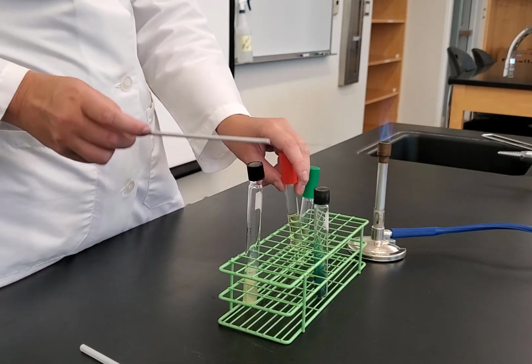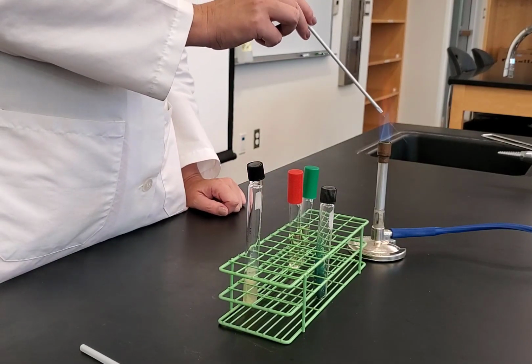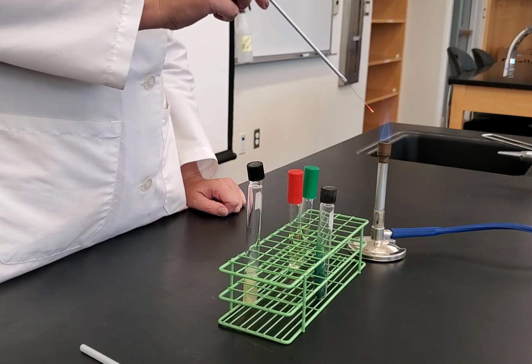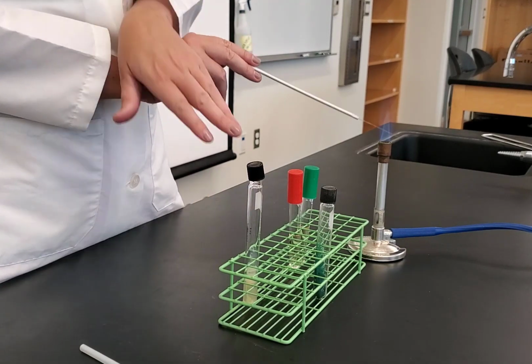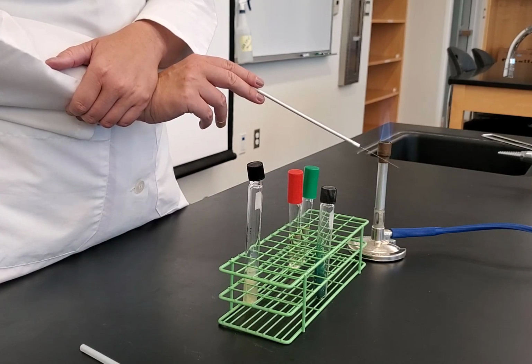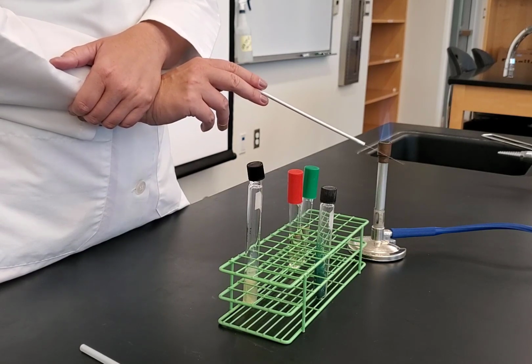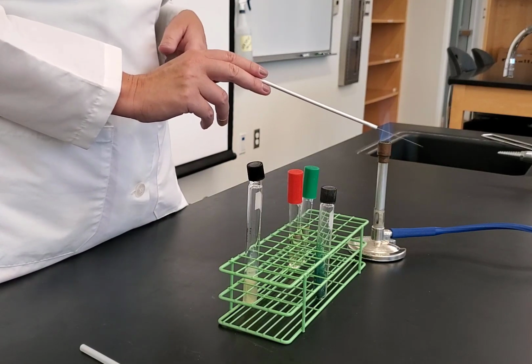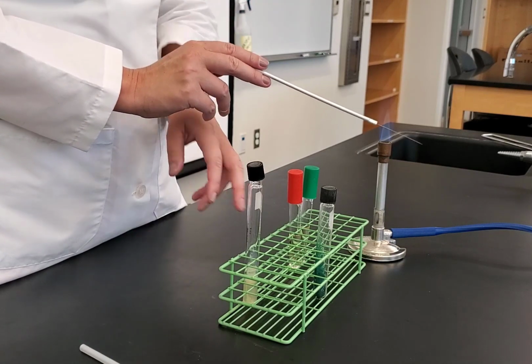I'm going to inoculate the citrate slant, remember, with a needle. So I pick up my needle, and I'm going to flame my needle, and I'm going to let it cool. Now, once this cools, I'm going to pick up bacteria. So I'm still going to inoculate my citrate slant using a zigzag inoculation. However, when I do that, I'm not going to stab inoculate. So not like in the OF test where it's a stab inoculation. It's still a zigzag inoculation, but it's using a needle.